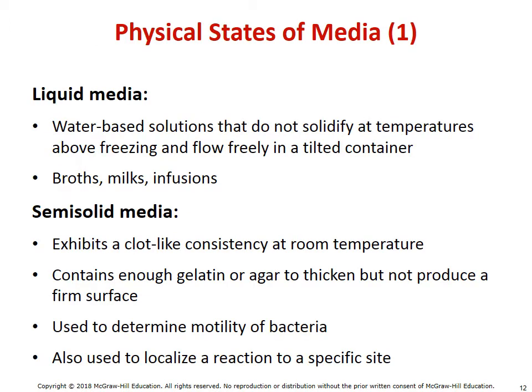With liquid medias, these are typically going to be water-based solutions, and they won't typically solidify above freezing temperatures. The idea here is these things in the normal environment stay liquid, allowing microbes to reproduce and be suspended in the liquid.